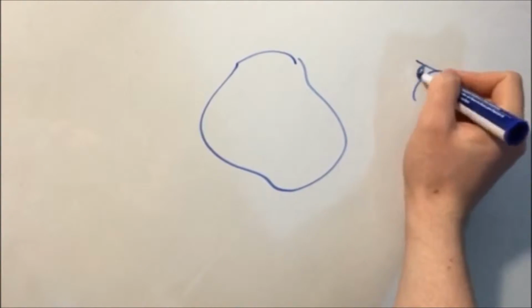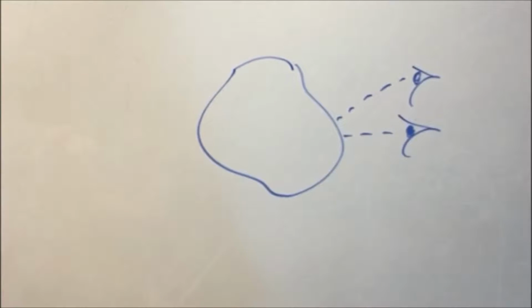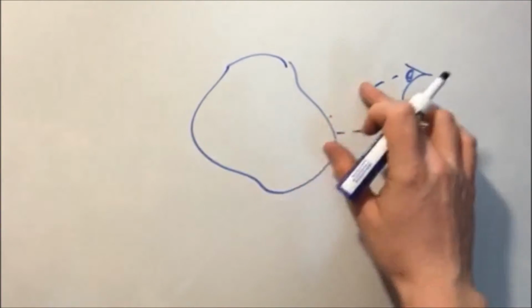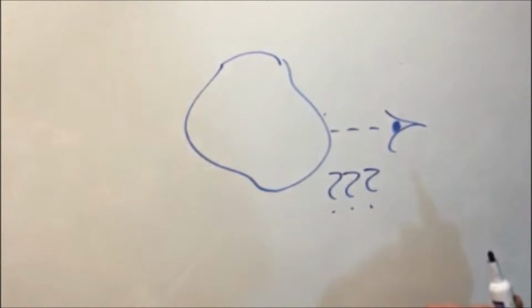This is easy for us because we have two eyes, two viewpoints that simultaneously view the object from very small angular separation. Our mind easily constructs our 3D view of the object from the pairs of 2D images that our eyes record. But what if we don't have two eyes, instead only one? Is it still possible to view an object in 3D?